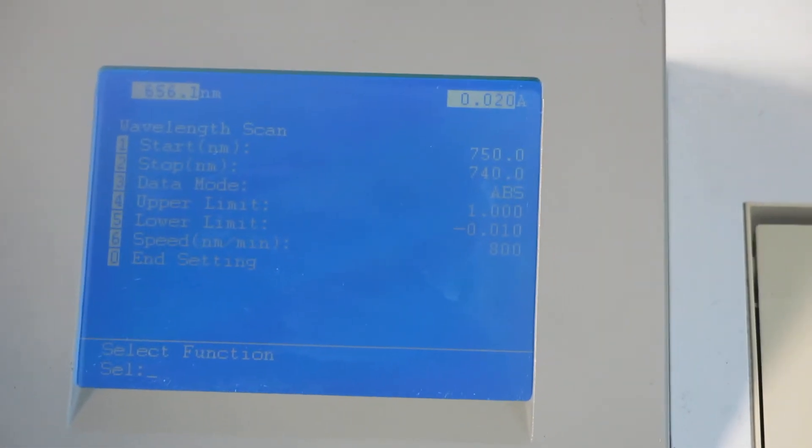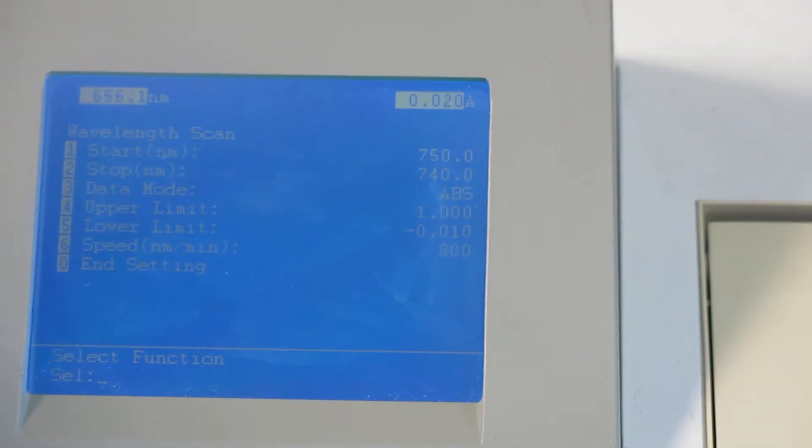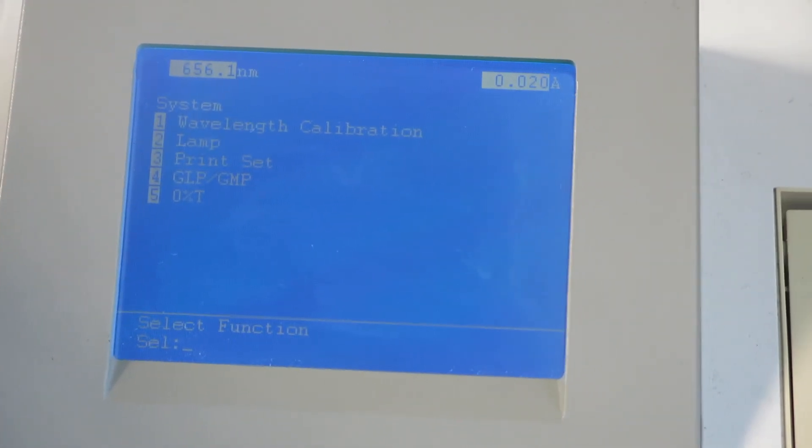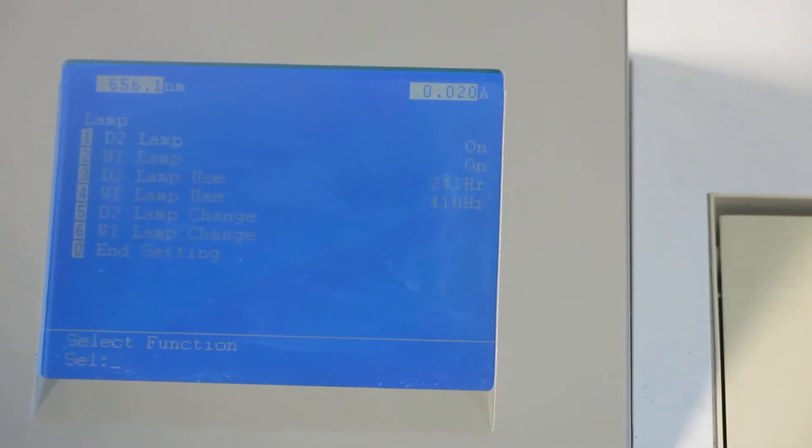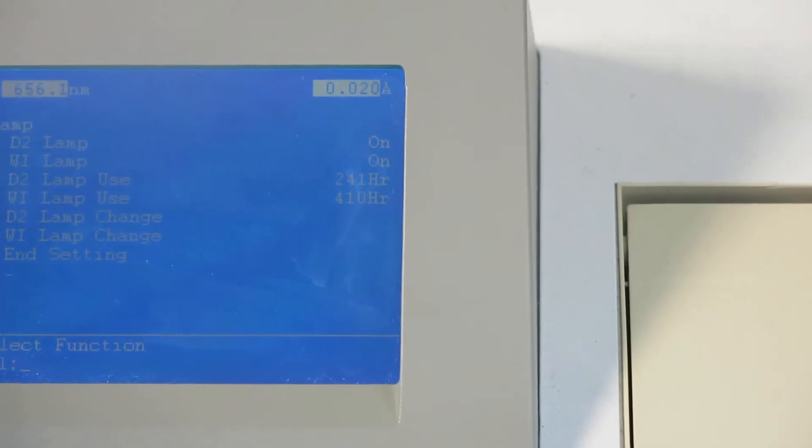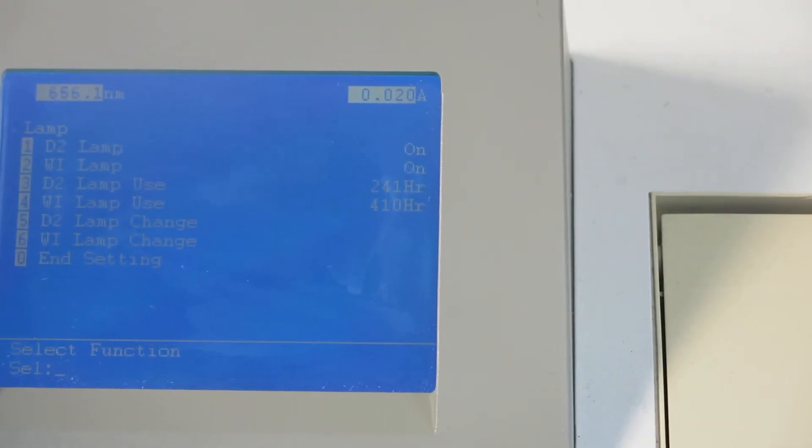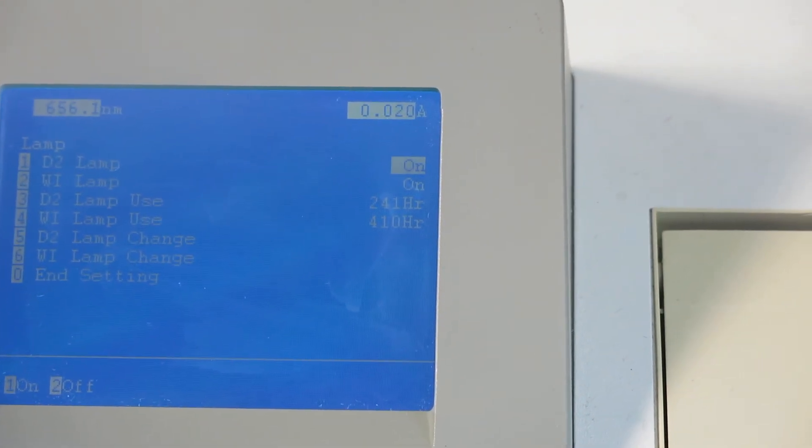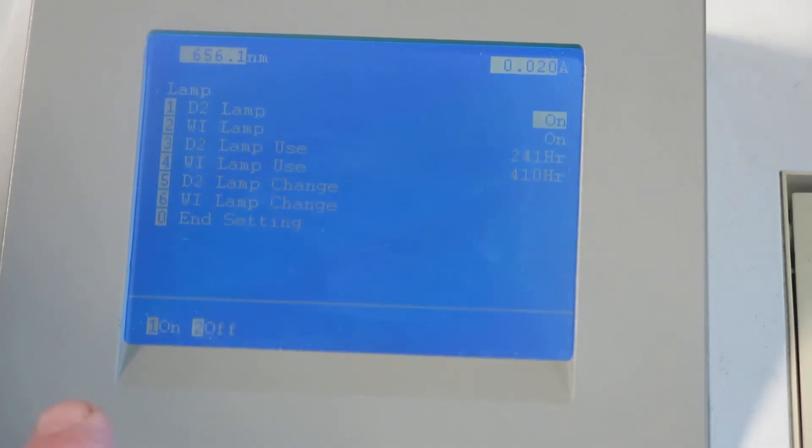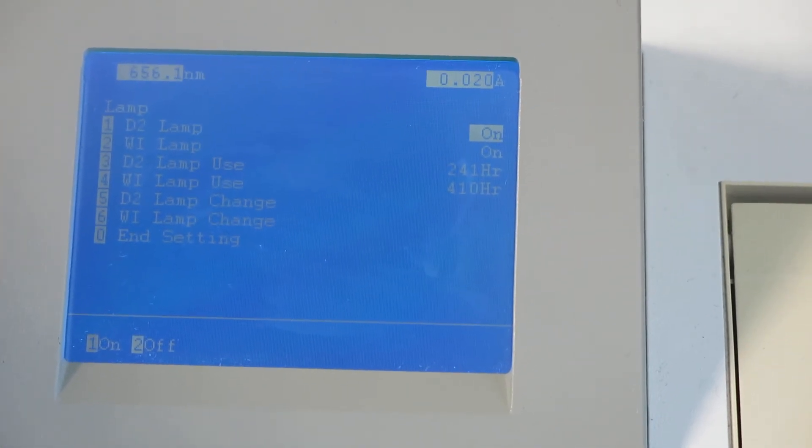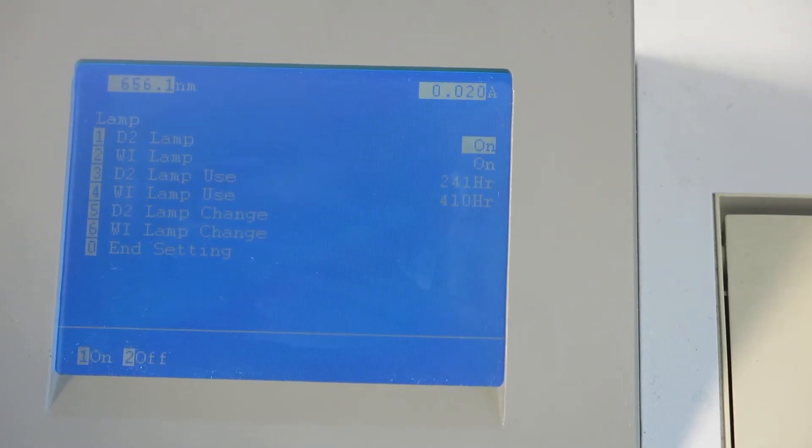Three. Main menu again. Four is system. Go over to the calibration lamp. Let's have a look at the lamp. So it's a deuterium lamp. It's a one. On. Off. It's on. You can hopefully see that there. The deuterium lamp, which is the important thing here. On all manner of other features.